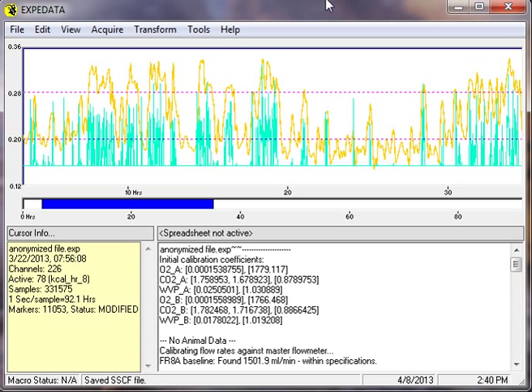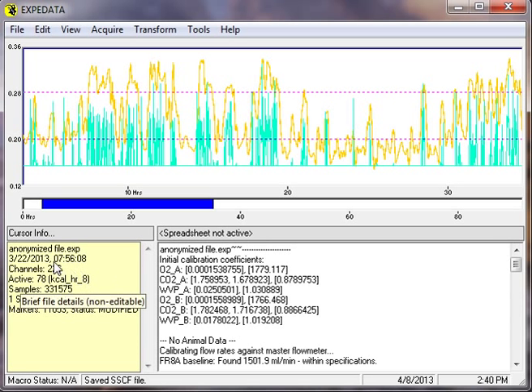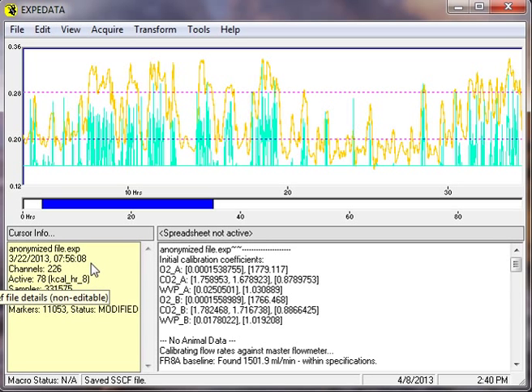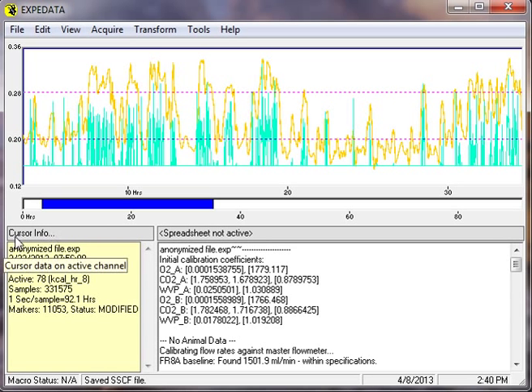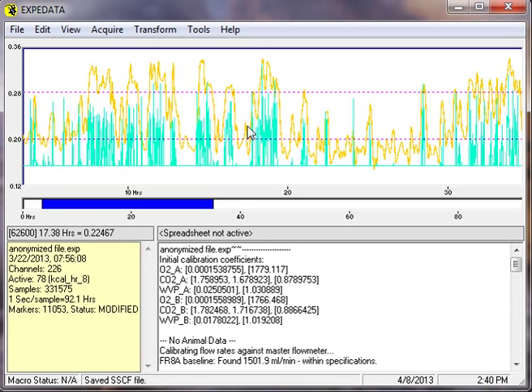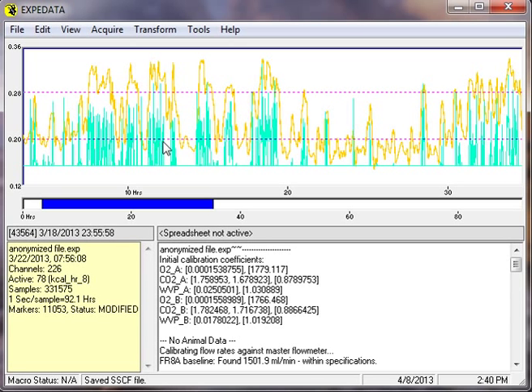I'm just going to give you one quick additional tip as well. The axis that we have here, the x-axis, is in simply elapsed time from the beginning of the recording. But if you need more actual time information, the time here and date is the exact time and date at which this file ended. And if you want to know the time corresponding to any particular moment in the recording, notice this cursor in sort of a box here that I'm moving the cursor around on. Hold down the control key, and that gives you the exact date and time of the position of the cursor.